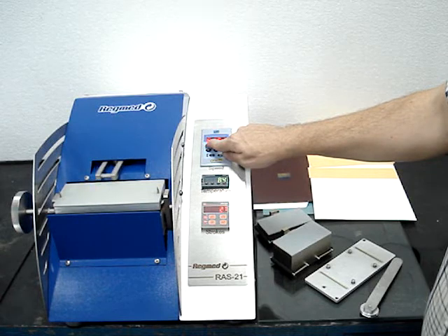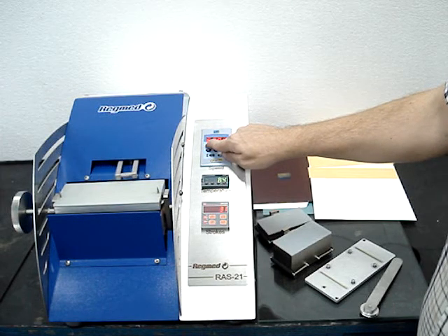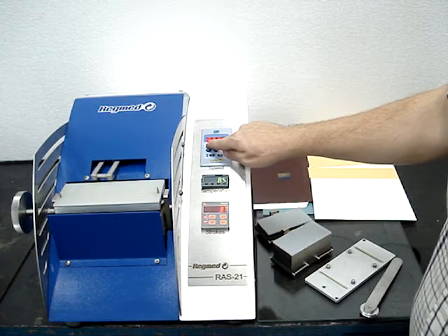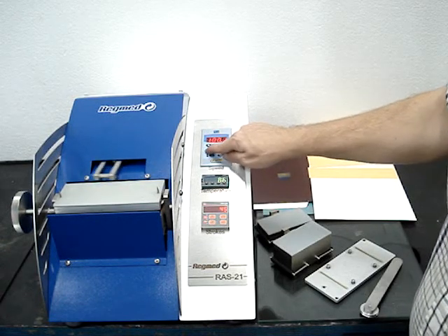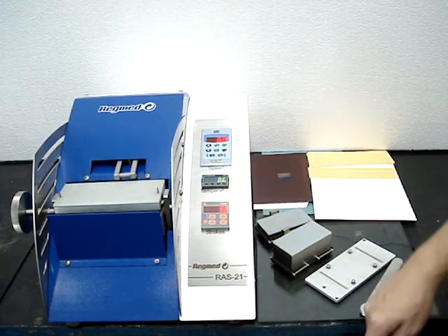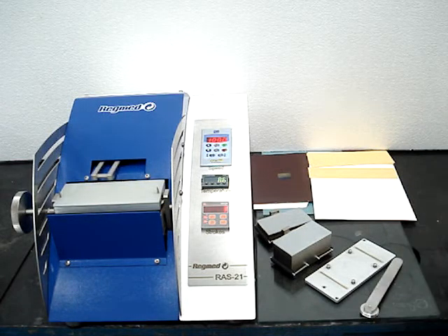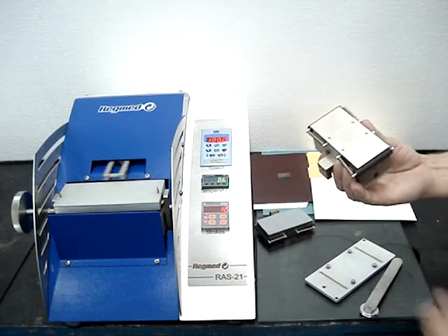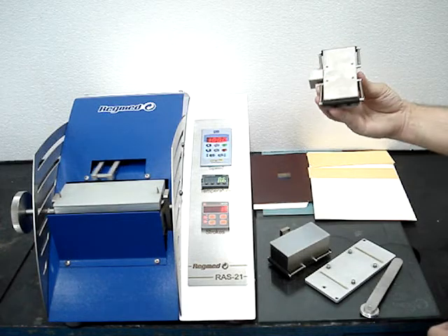You can notice that the speed is increasing. The speed set will be automatically stored for the next test. You also must select if you want to use the heavy weight or the light weight test weight.